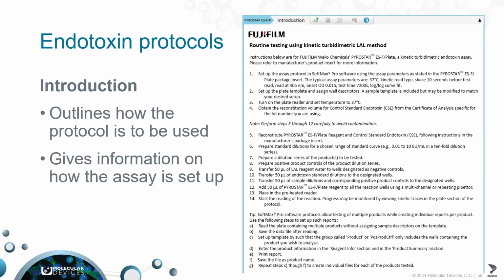It also describes how to set up the protocol's template so that the samples in the different wells of the microplate will be analyzed appropriately. Instructions on entering information in the reagent info and product summary sections, which I'll show you in a moment, are also given here. Also part of the protocol are the user entry and the signature section.